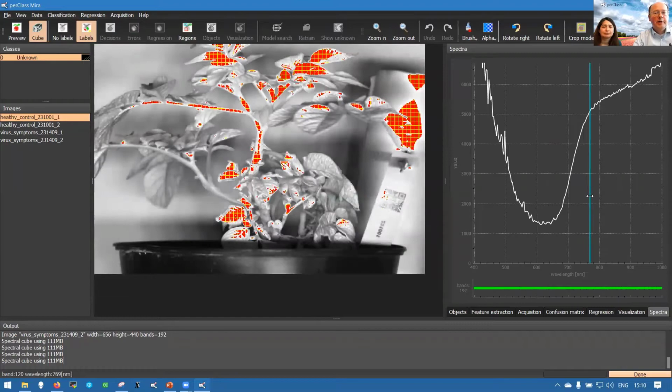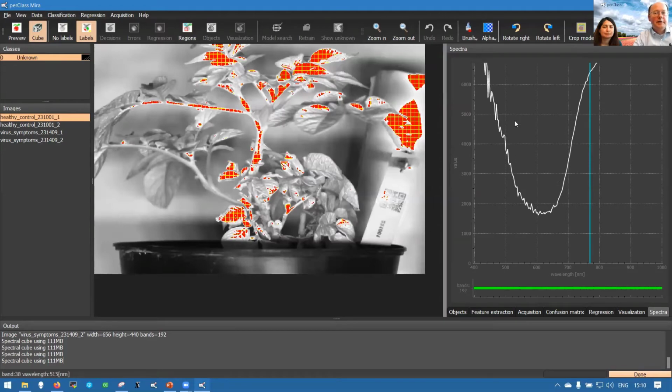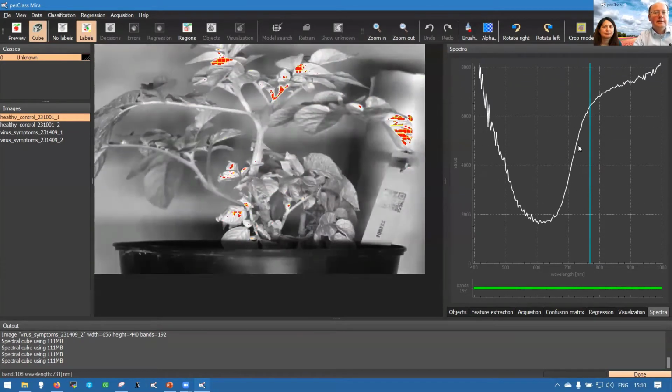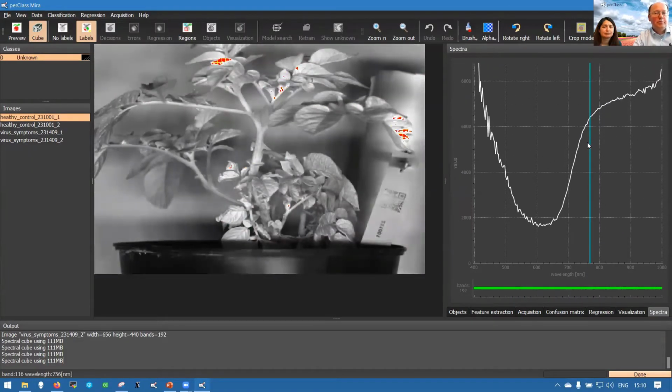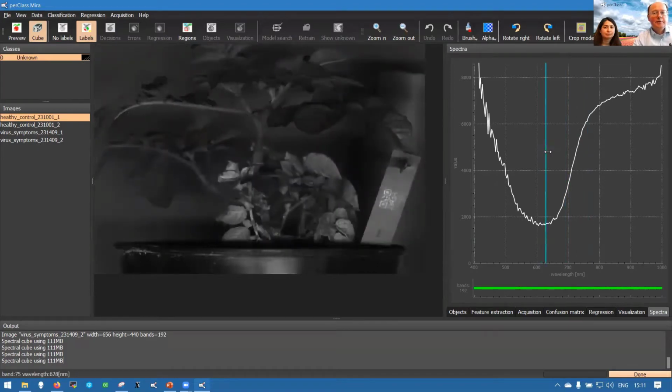The reddish part is just a visualization thing that is basically showing us that pixels in this area are above the upper bound of the plot. So it's not changing the data in any way. It's just adjusting the range. And this is a single band view.